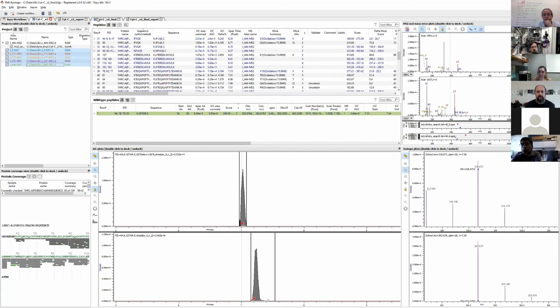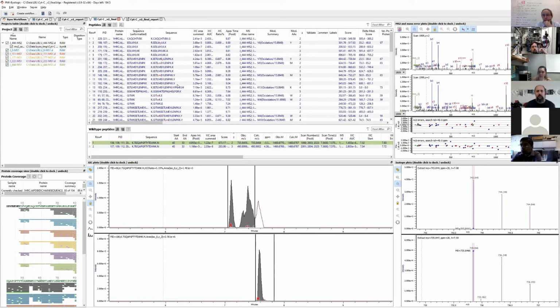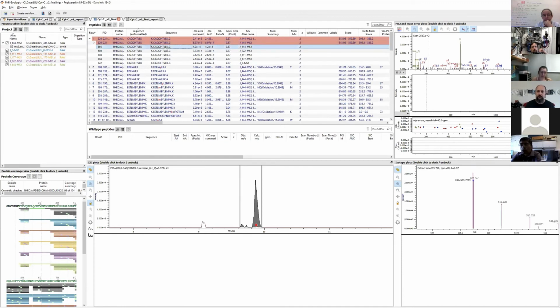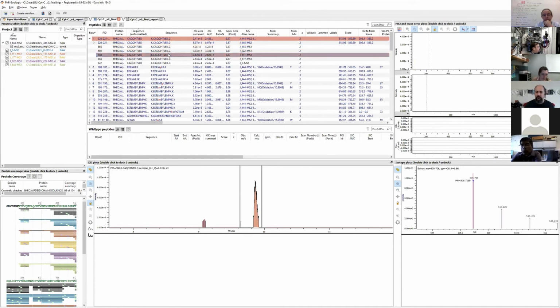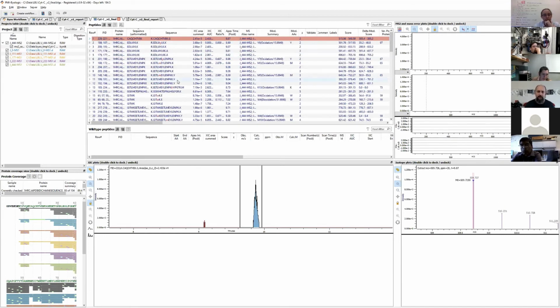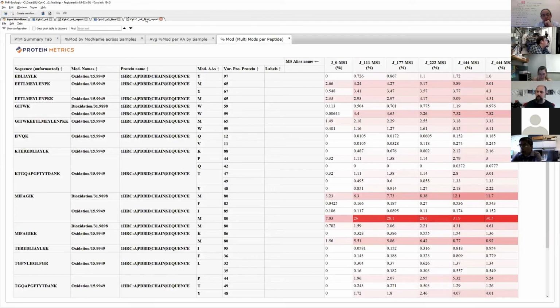So we're going to jump onto that, which is this project. So now each row, when you expand on it, you're going to see 6 sub rows, and these will be the individual samples. How it looks in different samples, the same peptide. All right. So at this point, we don't have to do anything. If the retention times are aligned, there's absolutely no problem, which in this data is perfectly aligned. Everything should match up, and we can move on to the report where we're going to actually see the overview of these modifications across the 6 samples we have and how they differ, what are the changes.